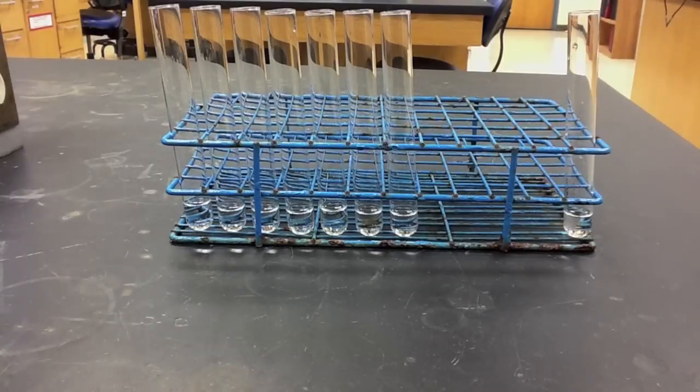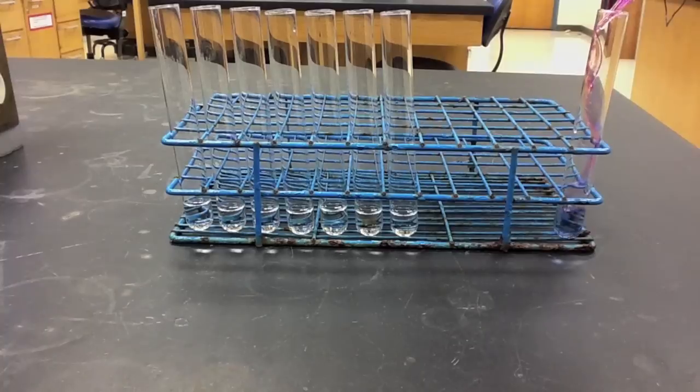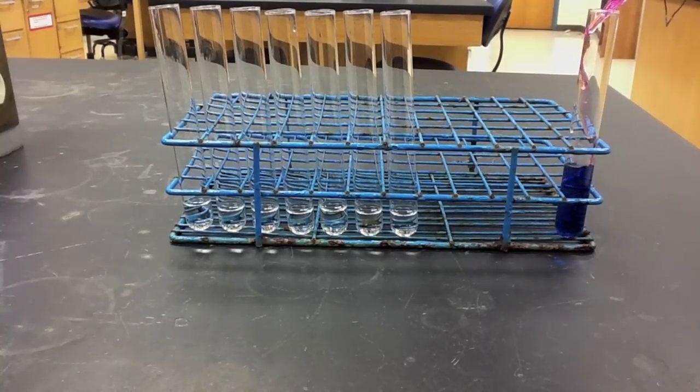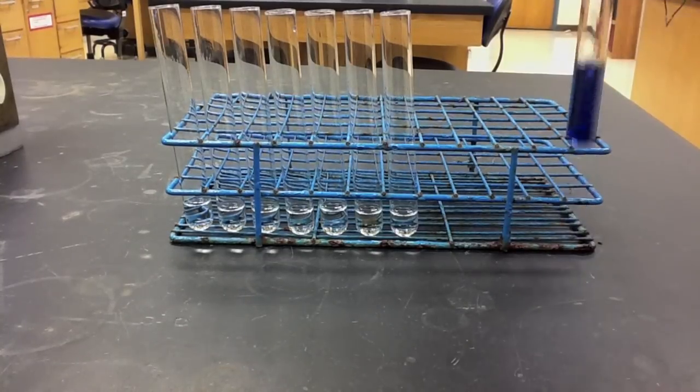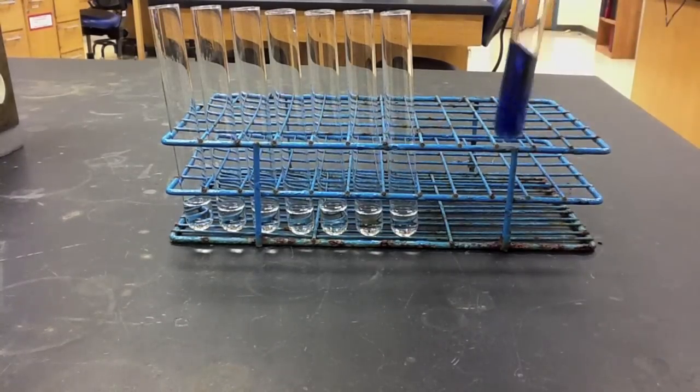I start by adding the anthocyanins to both the unknown sample as well as the seven known buffer samples. As I add the anthocyanins, I see a distinct color change in the solution, and this directly correlates to the pH of that particular solution.